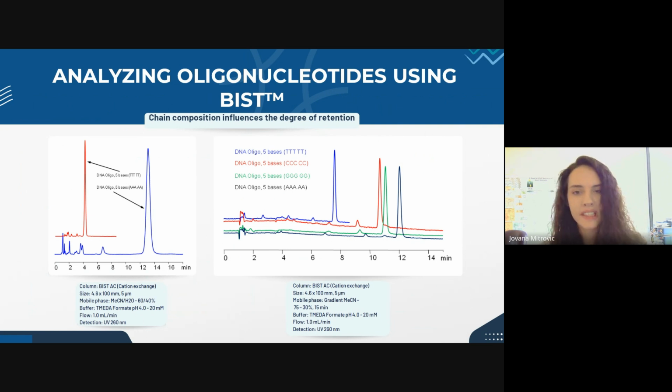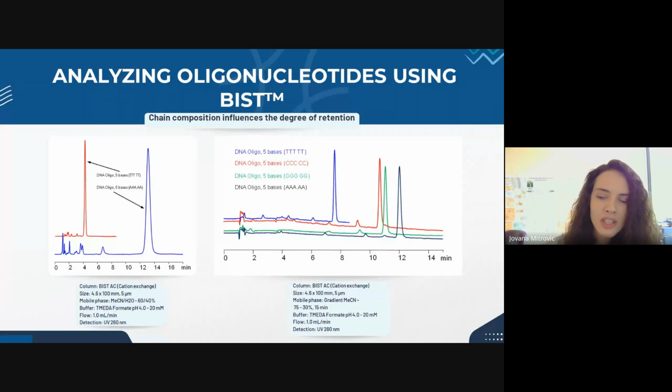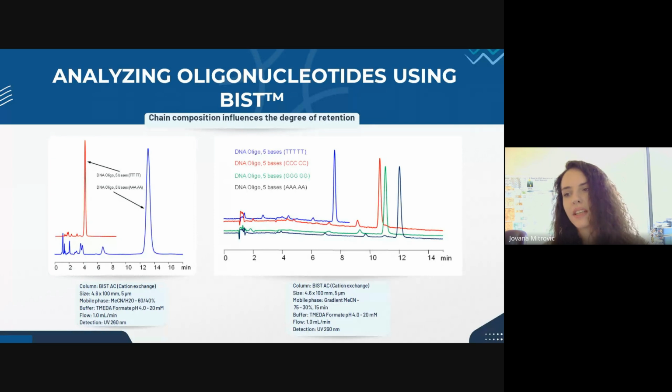For example, reverse phase columns typically offer poor retention because there is minimal hydrophobic interaction, while ion exchange methods might seem more suitable. They often require high concentrations of buffer salts to elute these analytes properly. And again, this leads to issues with peak shape, reproducibility, and just adds unnecessary complexity to mobile phase preparation.